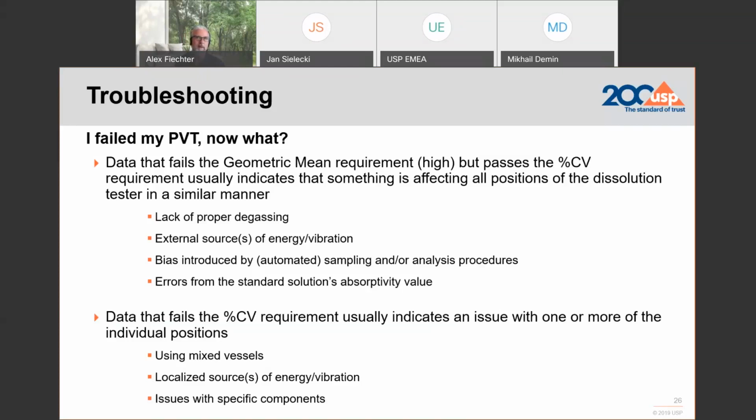If you assess this with an automated sampling procedure, you first have to verify whether or not you are within your self-defined range specs for the same system, with devices and assemblies qualified as such. Errors from the standard solution absorbance could be an issue for high geometric means.